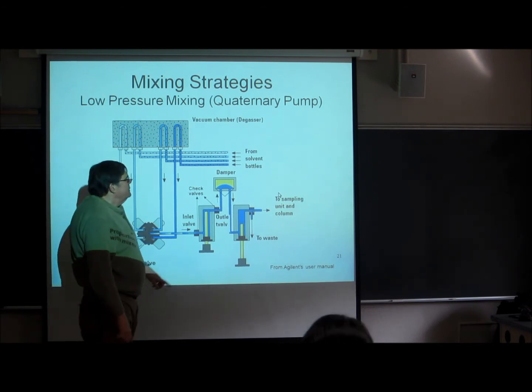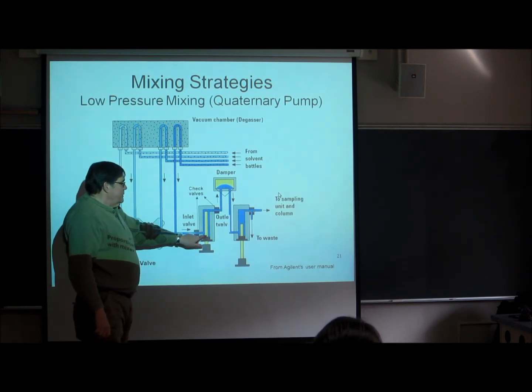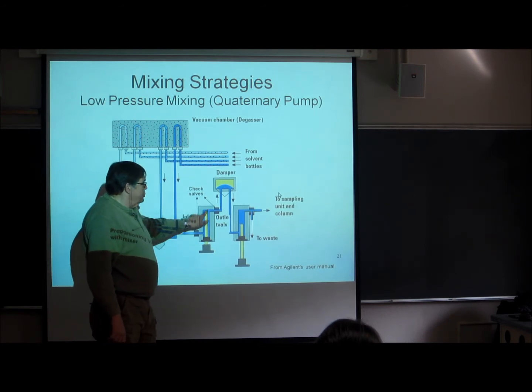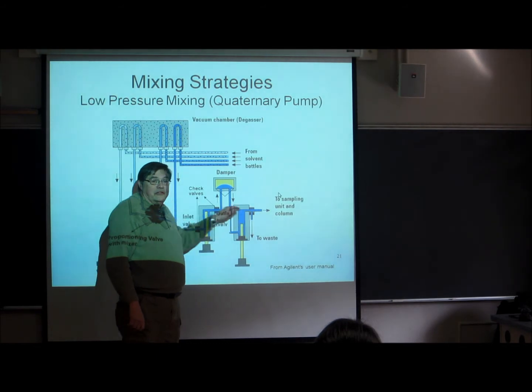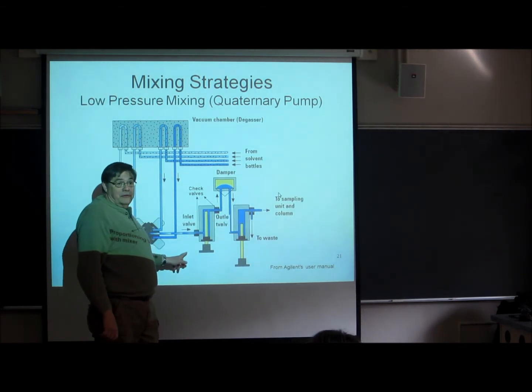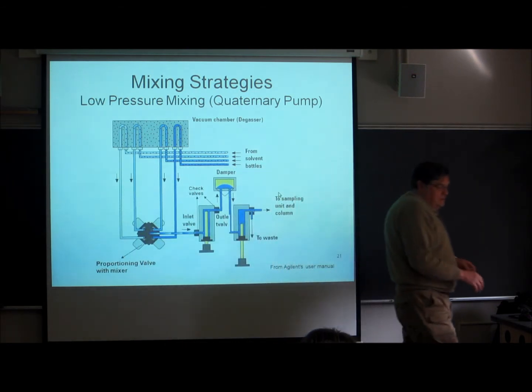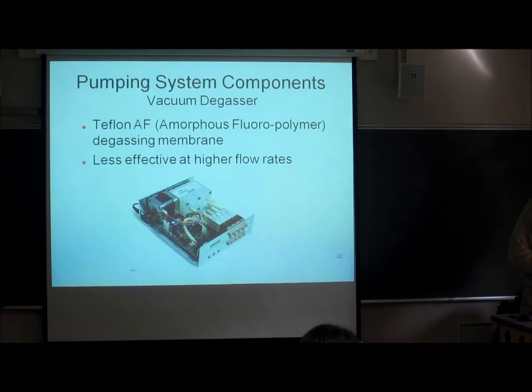Okay. Oh yeah, and while we're going on here, you can probably see that actually this first chamber serves as a pre-mixer for the final. There's mixing in this chamber, so you actually get some benefit from extra mixing in this.